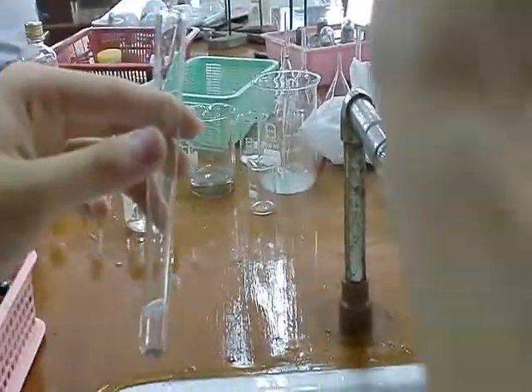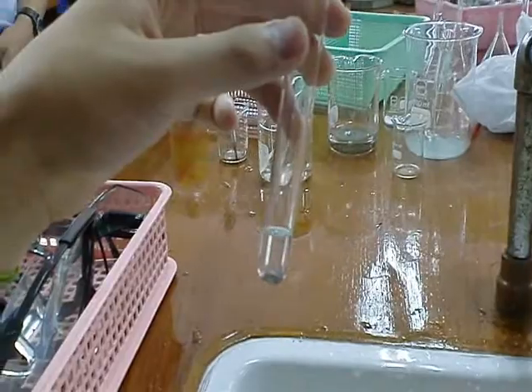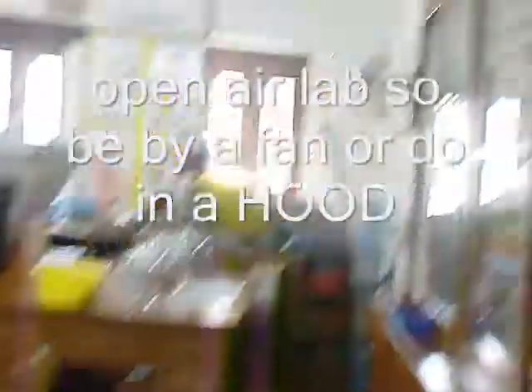Stay downwind. Ammonia station by a fan and a sink — you need to wash it all out.